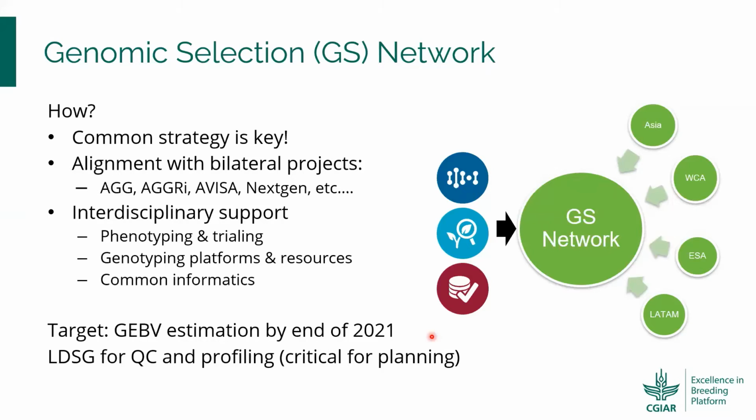In the near future, many of the key marker traits currently available through the low-density platform will also be validated and included on our new EiB mid-density platform. This is very critical for us to ensure that interoperability is maintained between the EiB low and mid-density shared services.